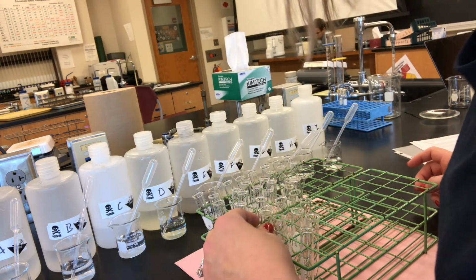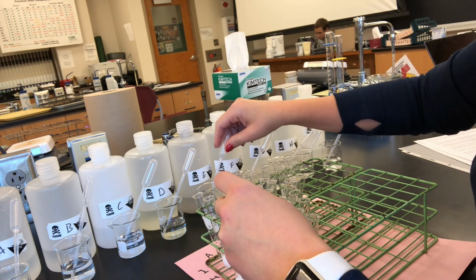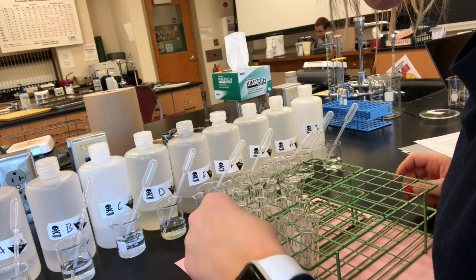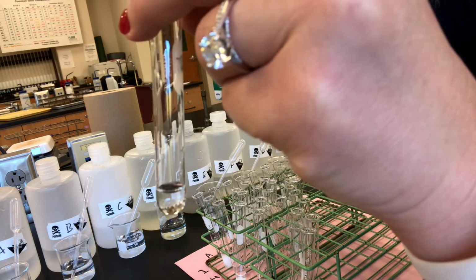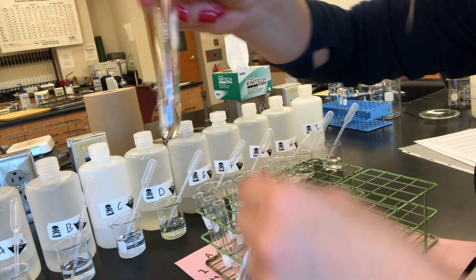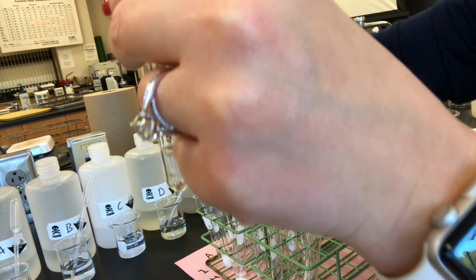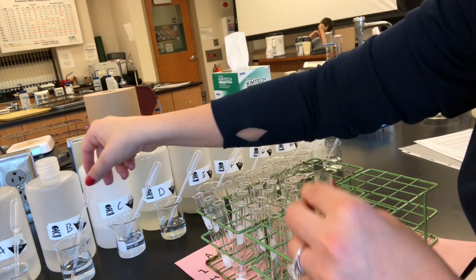So let's do A and E. A and adding E. Nothing. Now let's do A and we're going to add D. A and D. Nothing. A and C. Nothing. A and B.